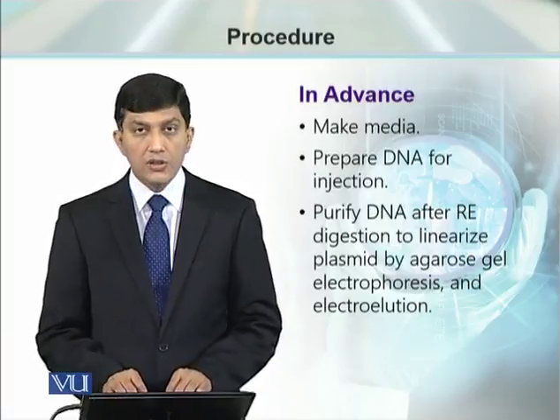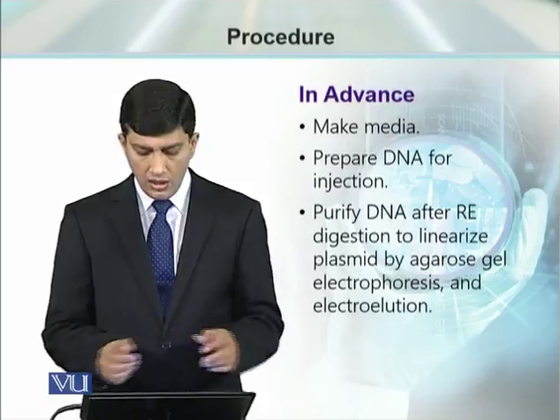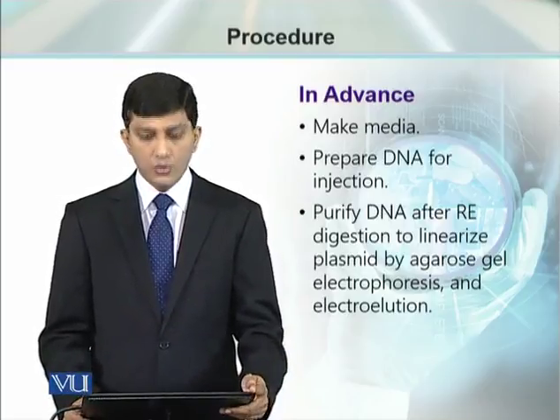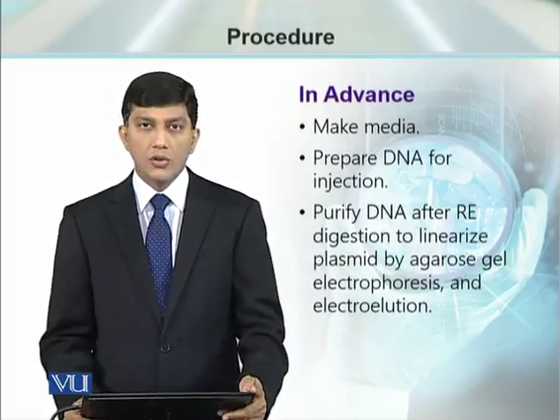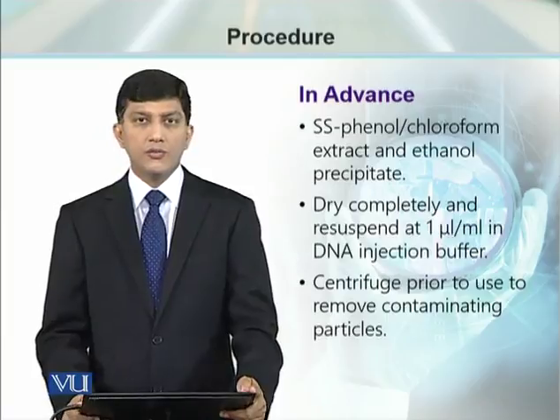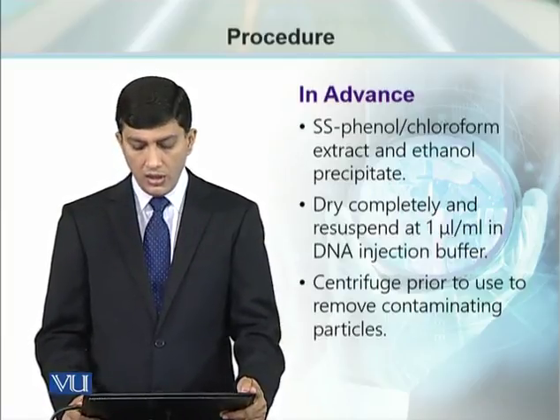For that purpose, we need to purify the DNA after restriction digestion, and after linearizing the plasmid, if any, through electrophoresis and electroelution. Then purification is done using the phenol chloroform method. Extraction is done and purification is done.